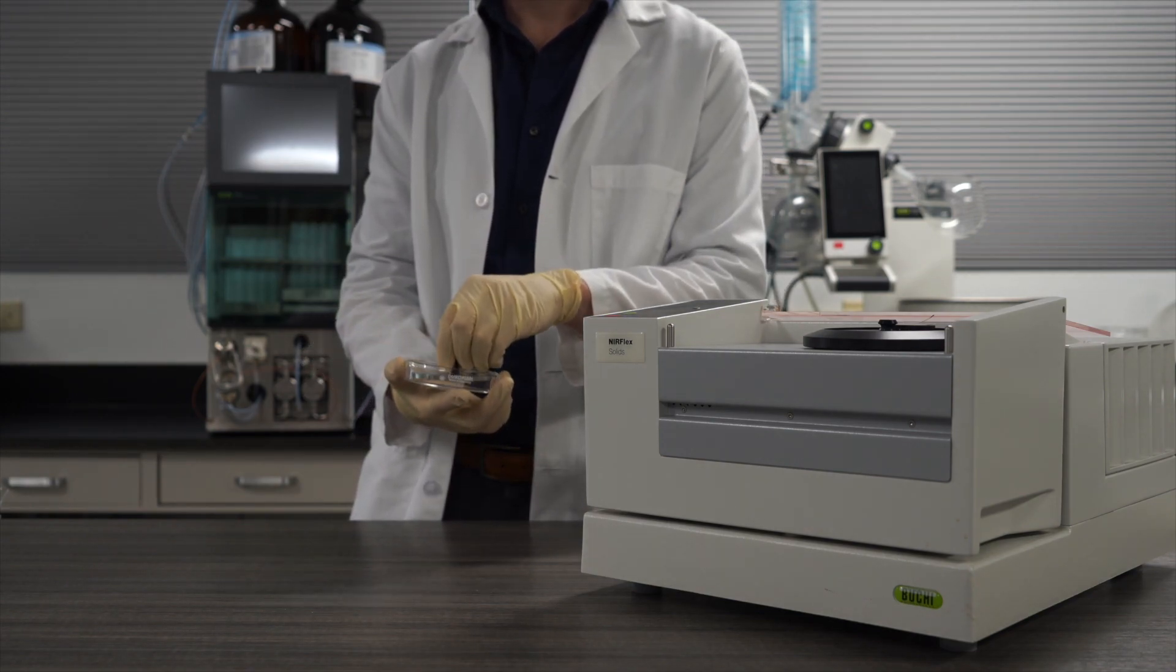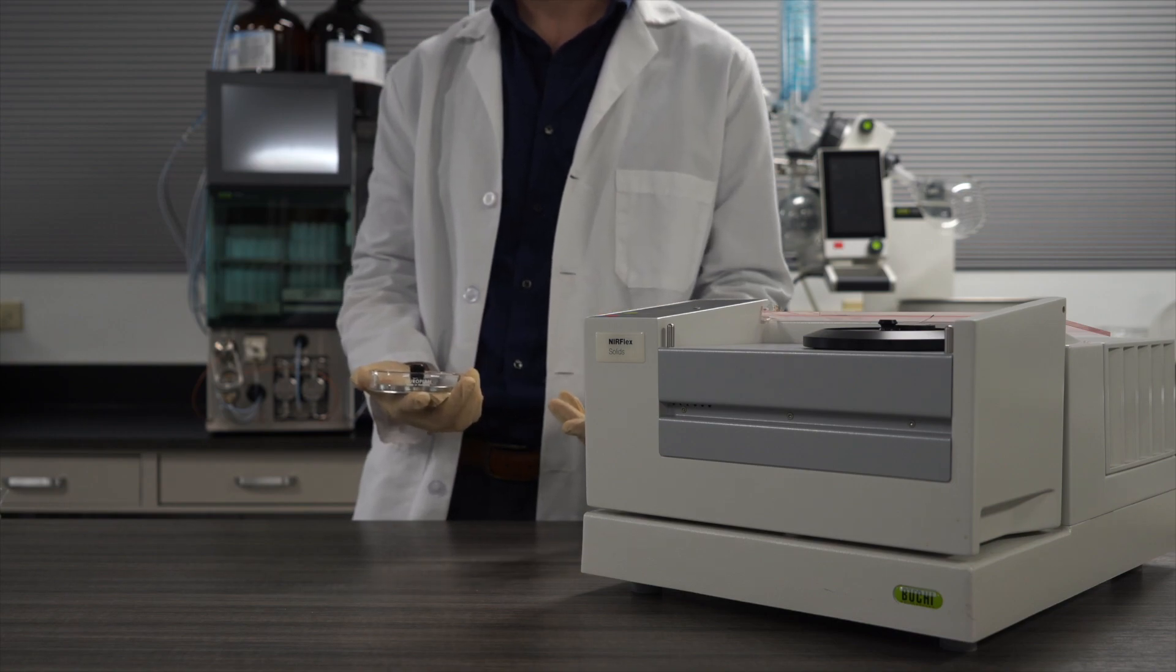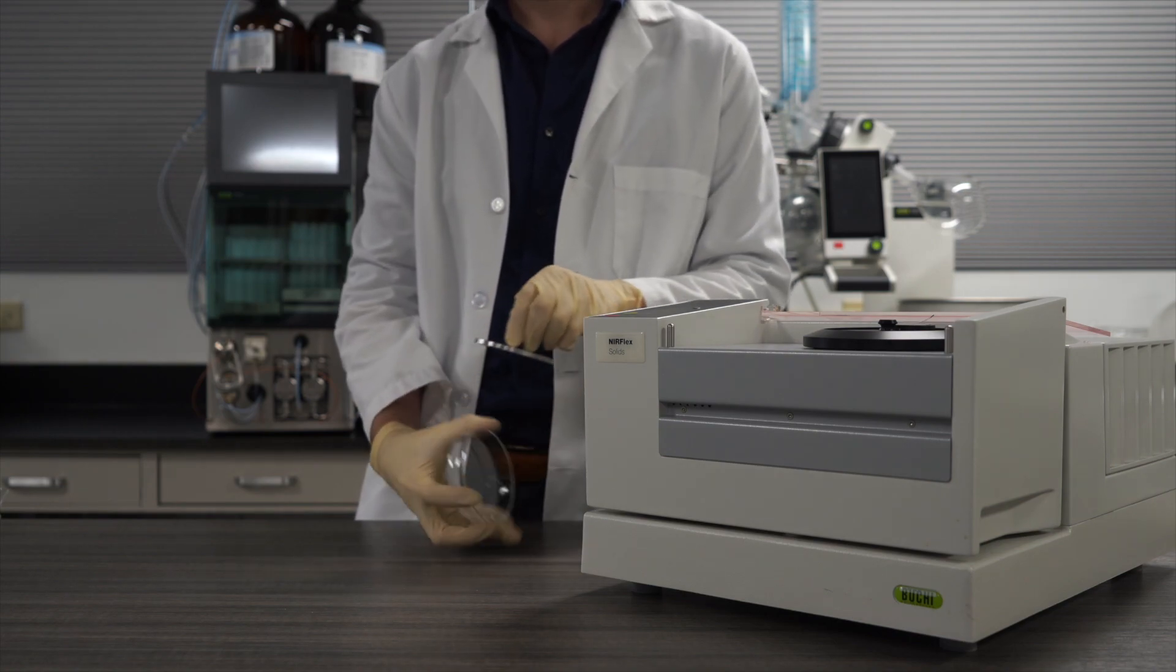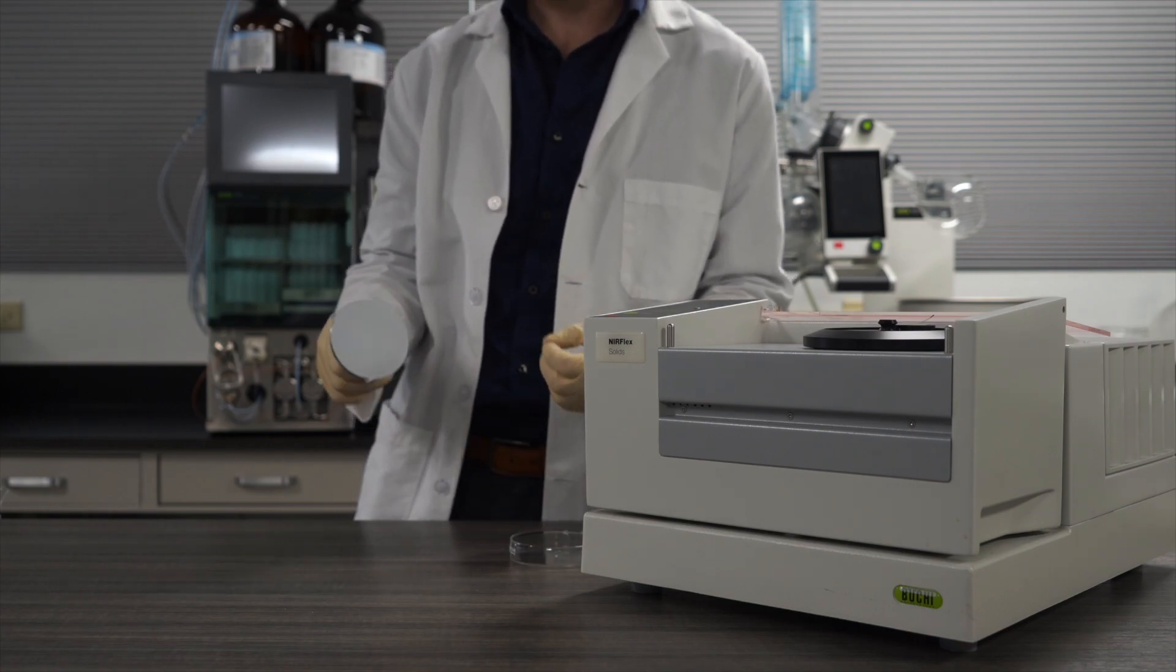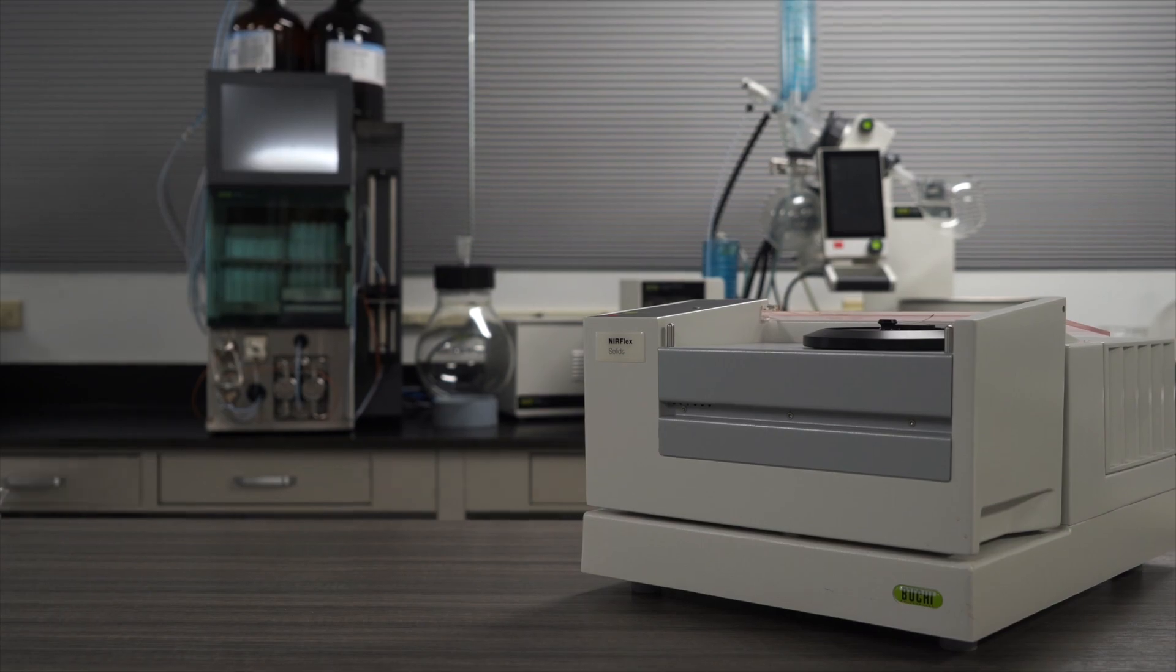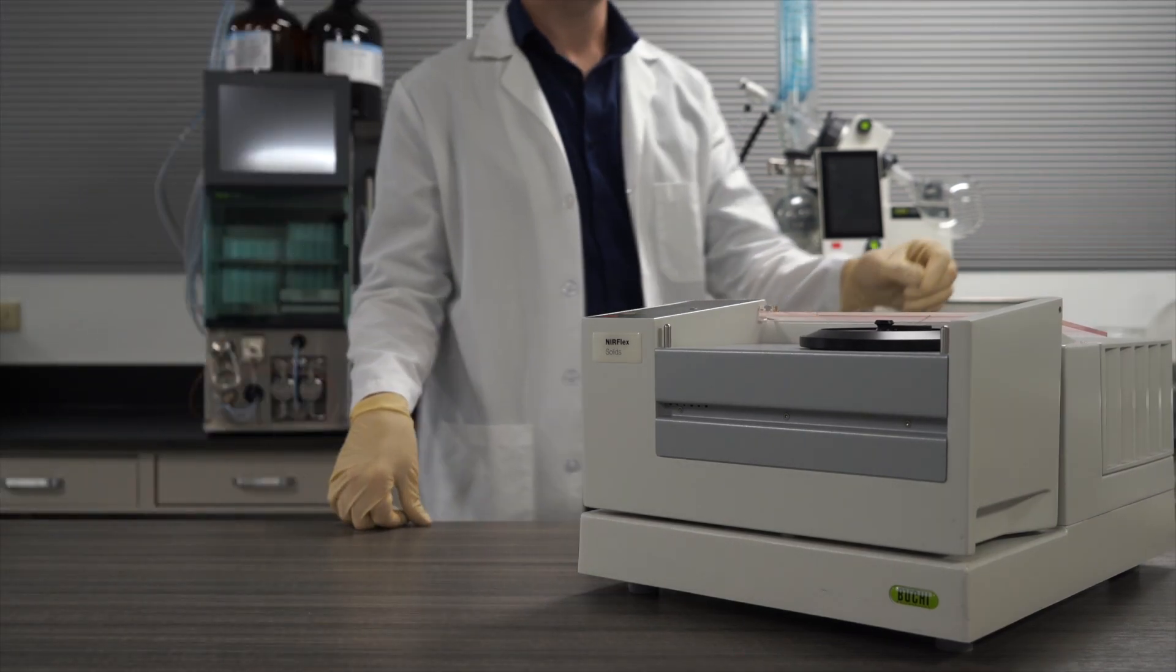All you have to do is add this handy little transflectance cover to a sample cup containing anything from a clear liquid to a semi-solid. The cover has a reflective metal surface and little legs. These features provide a fixed path length, enabling a simple transflectance measurement.